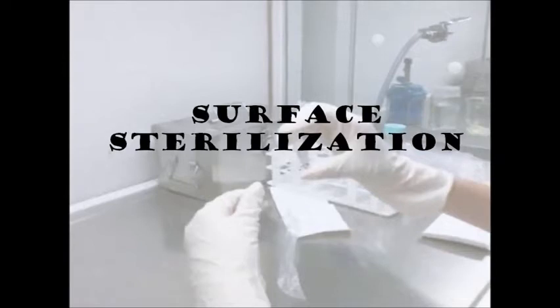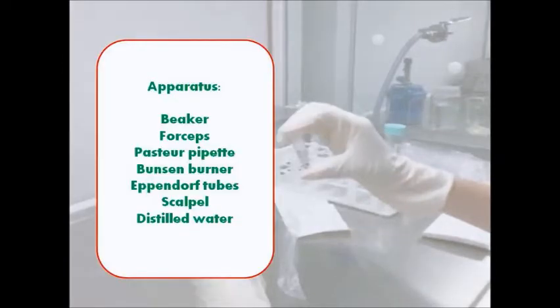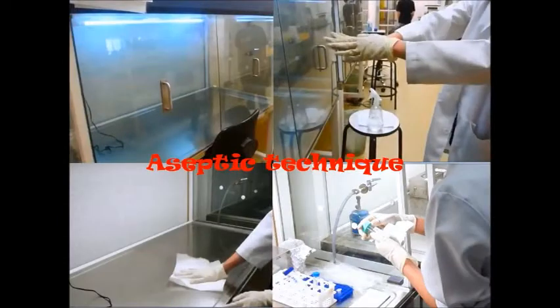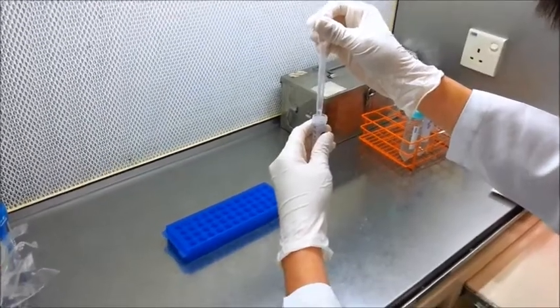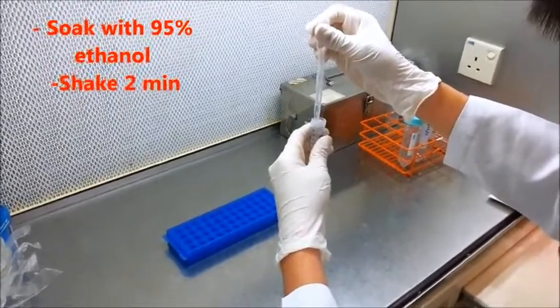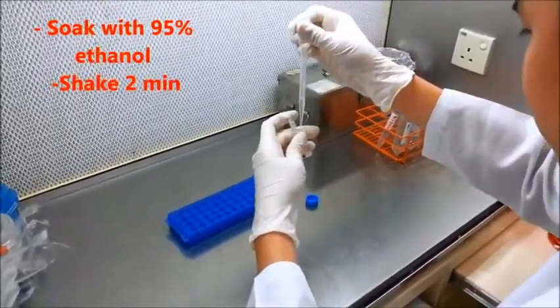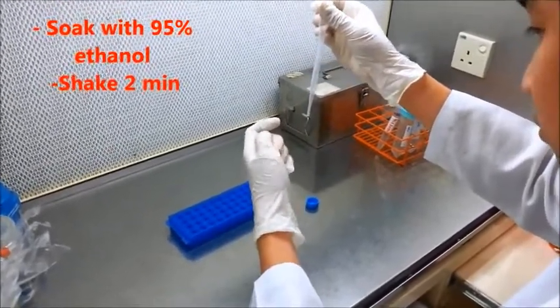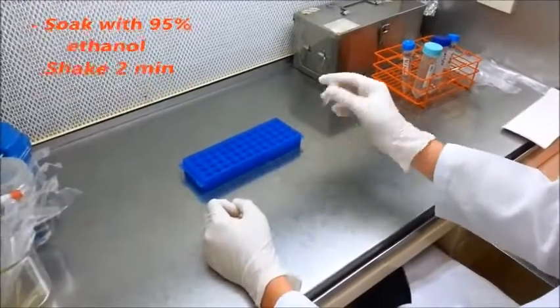One of the procedures in plant tissue culture is explant preparation and inoculation, where most explants require surface disinfection before they can be placed in culture on the nutrient agar. The following steps were conducted using standard aseptic techniques. Firstly, 95% ethanol was added and the explant was left to soak for 2 minutes. During the soaking process, the bottle or Eppendorf tube was constantly shaken to maximize the process.